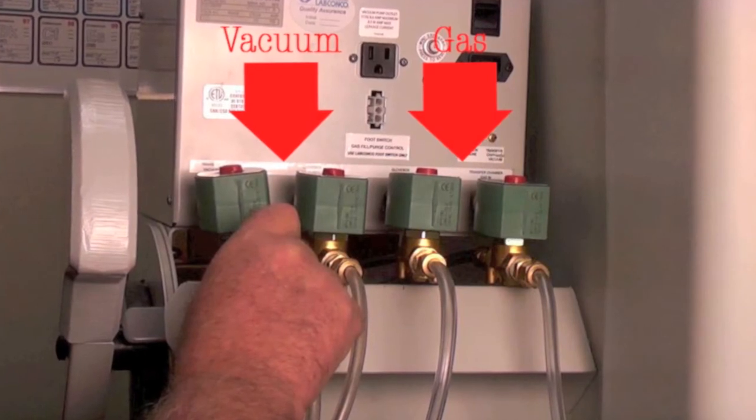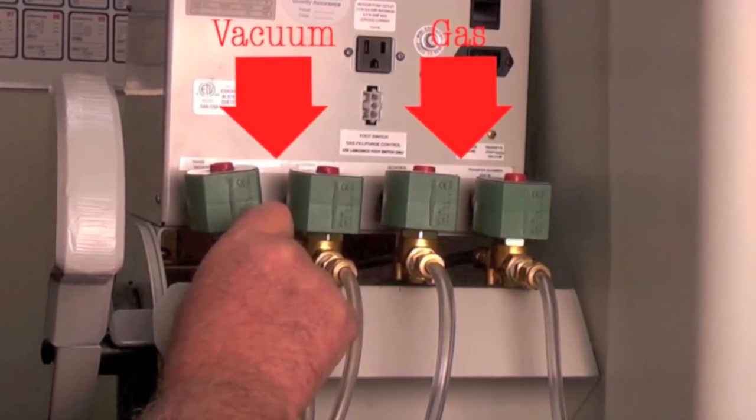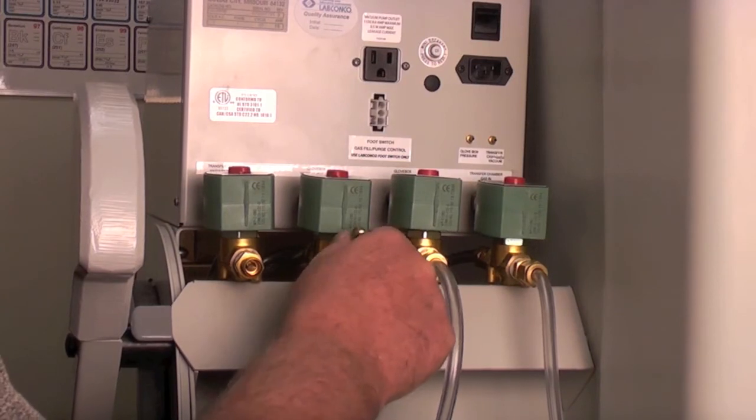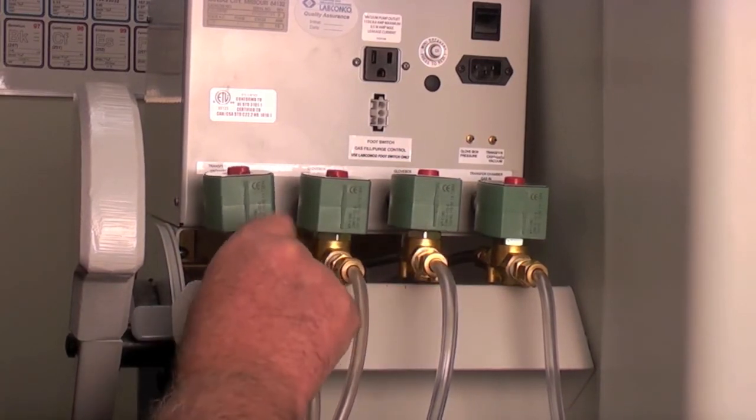Insert one end of the four tubing sections into each of the four solenoid valves on the pressure controller and tighten.